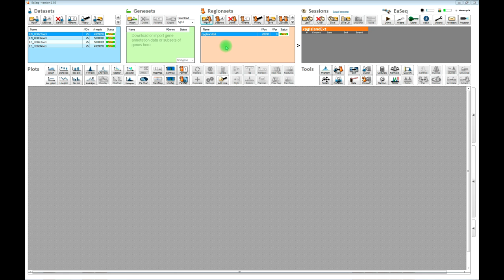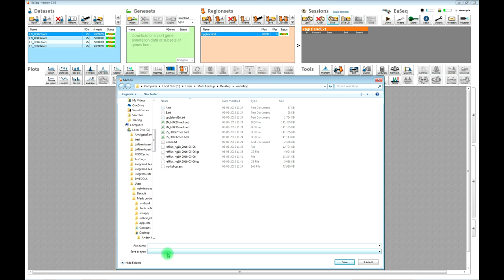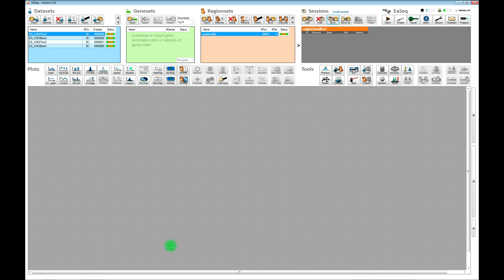Now that the datasets and the region set have finished importing, it would be a good idea to save the data as a session file. That's a single file containing all the datasets, gene sets, region sets, as well as potential plots and auto-generated descriptions. It will cut down the time it takes to import the data and make it easier to find your way through your data. Saving a session is done up here in the session area — just click Save. Sessions can be loaded like any other file and make it easy to go back to the analysis at a particular stage. We will do it again later once we have created some plots.